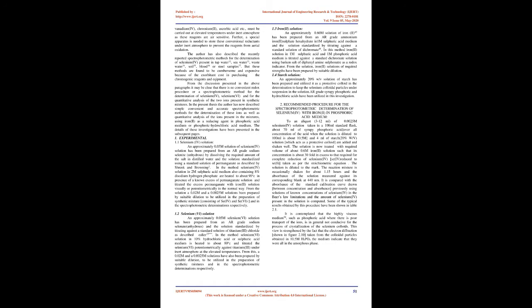It was earlier mentioned that the endpoint in these methods was detected either potentiometrically, photometrically, spectrophotometrically, or using a redox indicator. All these earlier methods, as mentioned in the last chapter, suffer from one disadvantage or another. To mention them briefly, most of these methods are indirect, in which Se(IV) solutions are treated with a known excess of an oxidizing or reducing agent mentioned above, and the excess is back titrated with a suitable reagent.